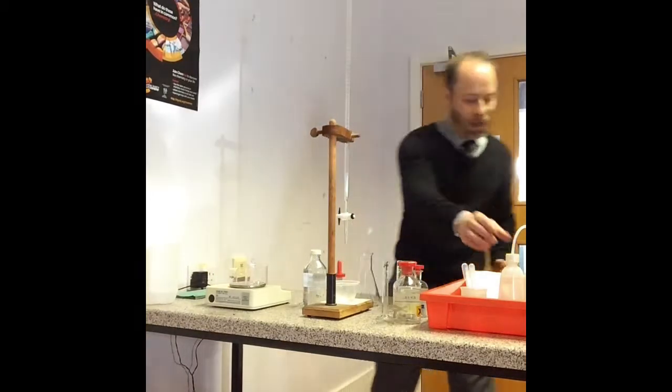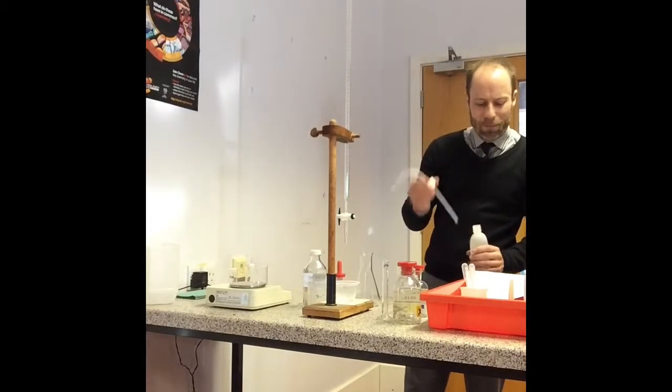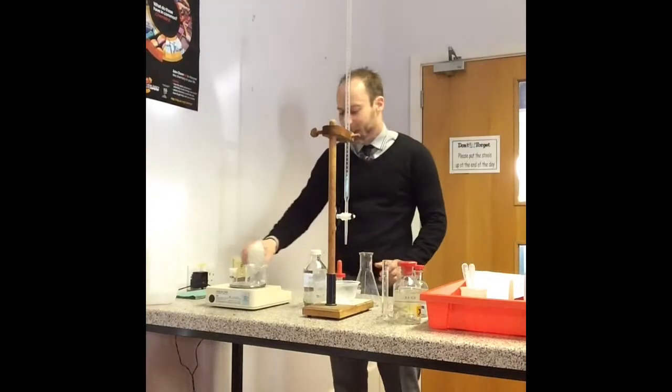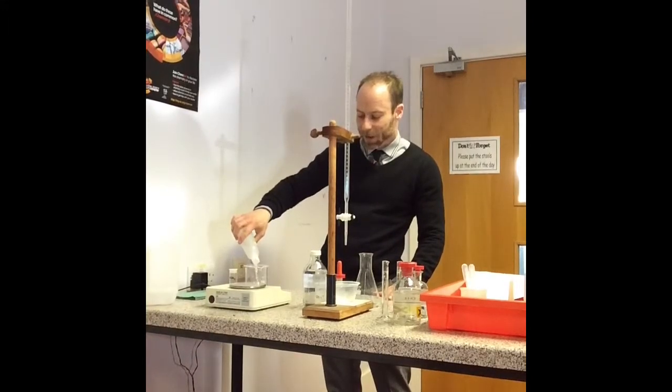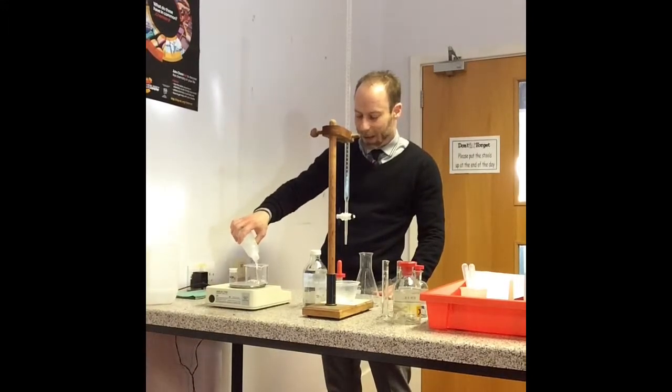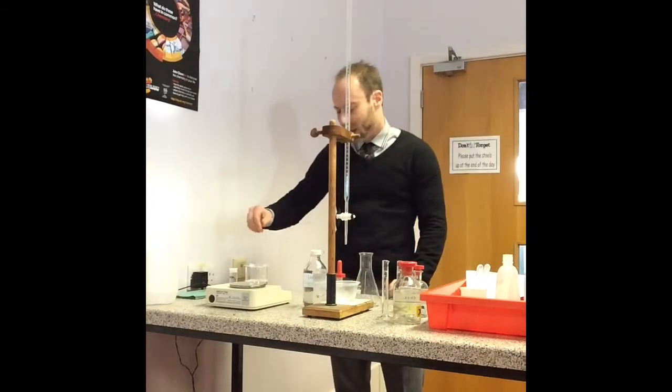I need to dissolve this up and it takes a while. So I'm going to dissolve it in about 150 centimetres cubed of distilled water. This takes a few minutes, so I'll get that in and then give it a quick stir.